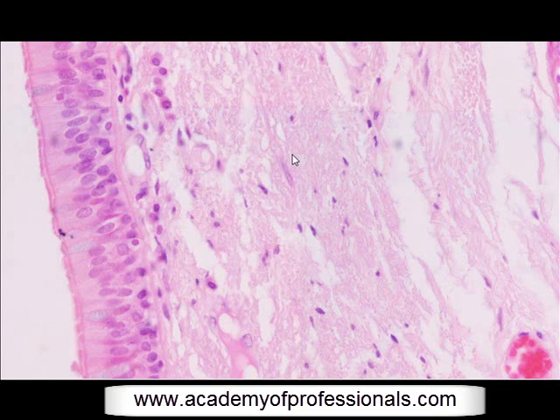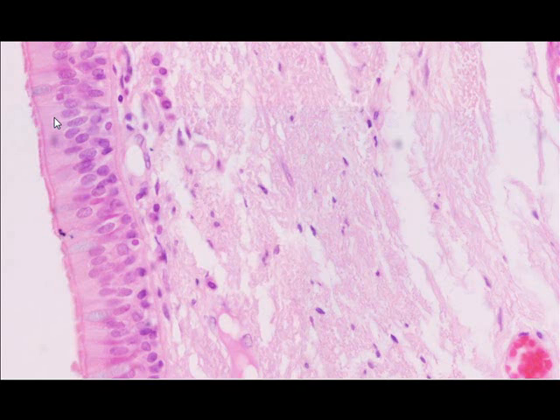The objective of this video is to make you familiar with identification of a few components of cells and tissues under light microscopy, which will help you throughout your professional career. Histology slides in this series are used as tools to make you understand what happens microscopically.